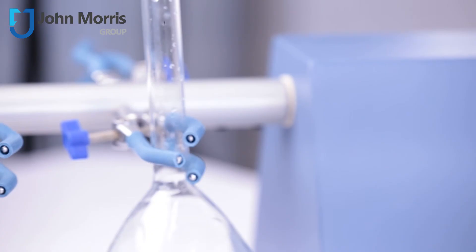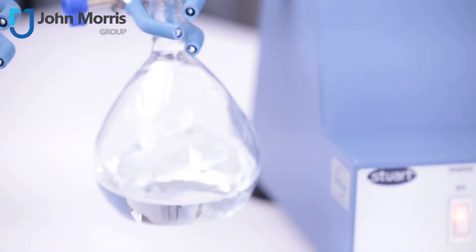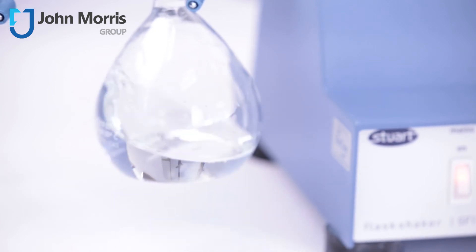And as with all Stuart products, you get a three-year warranty, and that means you can be relaxed about their reliability and commitment to customer satisfaction. So that's the Flask Shaker SF1 from Stuart.